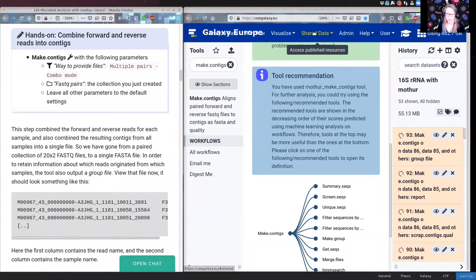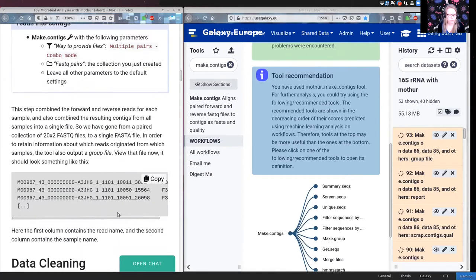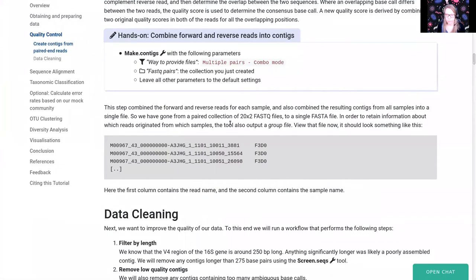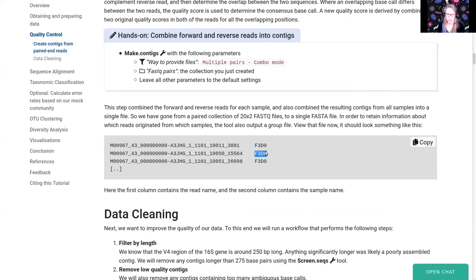This tool also takes all consensus sequences and puts them into one big file. Looking at the tutorial while we wait: the output will be one big FASTA file with all sequences, and a group file to remember which sample each sequence came from. The group file is simple — the first column is the read name and the second column is which sample it came from. We now have one big FASTA file and one group file that we provide to subsequent tools.